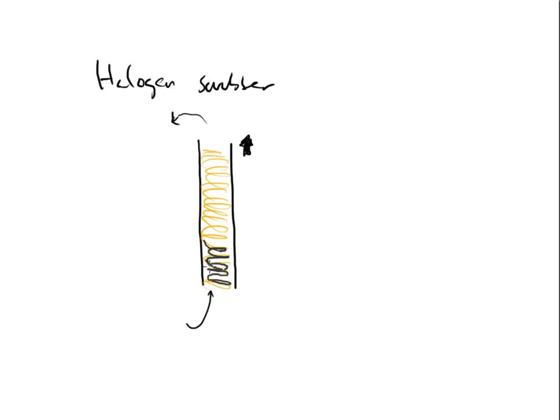And I can actually track it. Normally what happens here, and this is why the direction is very important, is that in the beginning, my darker area where it begins to tarnish on me will happen here in the bottom. And over time, as that halogen scrubber sits in the machine, and as I process samples over and over, the halogens will work themselves up further and further into the halogen scrubber.